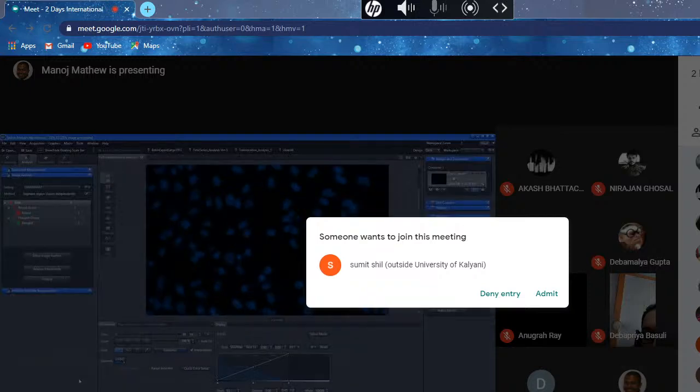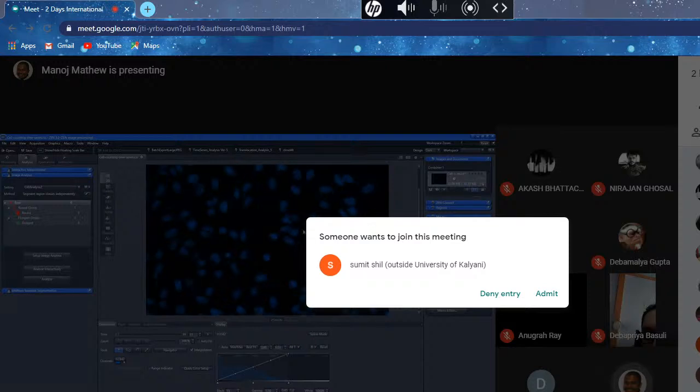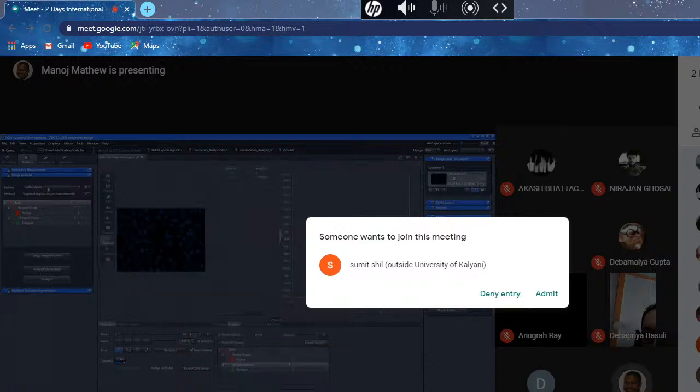Now, you would have remembered that this is a time-lapse image, and this whole workflow was created using just one frame, and that was enough. Now what I'm going to do is use this workflow to analyze the image. So every time I now have an image like this, I don't have to follow that rather long step. That's already saved. The only thing I have to do is click analyze. So I load the image, I load the workflow, I click analyze.